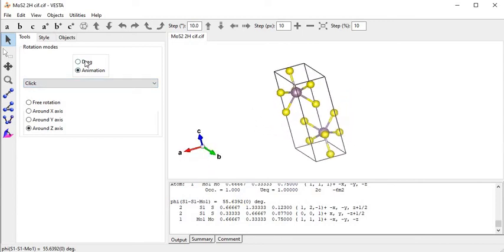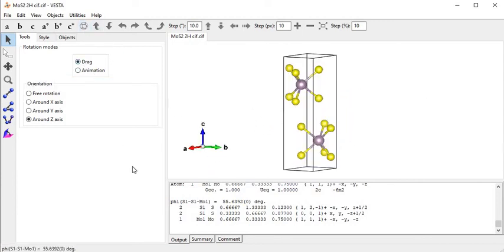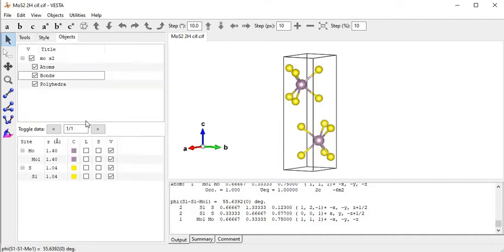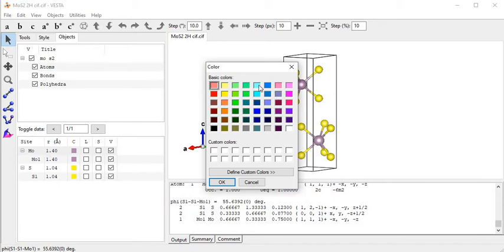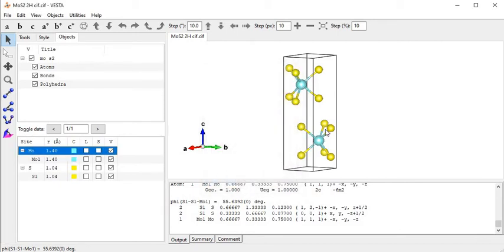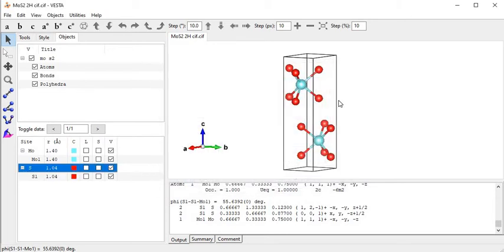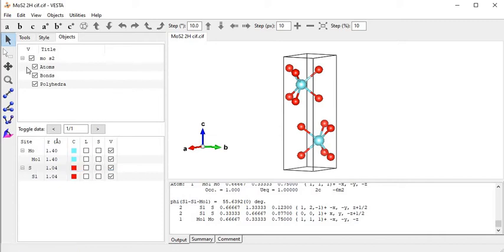Now I come to the Style but with the Object option. In that part we can also change the color by clicking on that part. Let's change the molybdenum color - click on that part and change it to red. This gives a completely different color. By clicking on those parts we can change the color of the atoms.